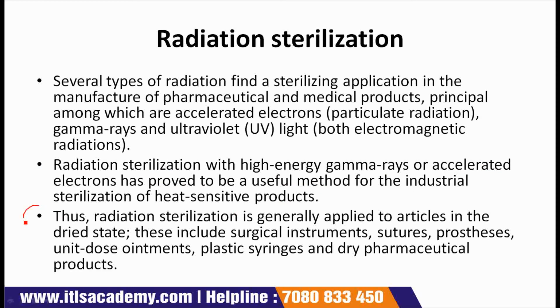Next point, thus radiation sterilization is generally applied to articles in the dried state.